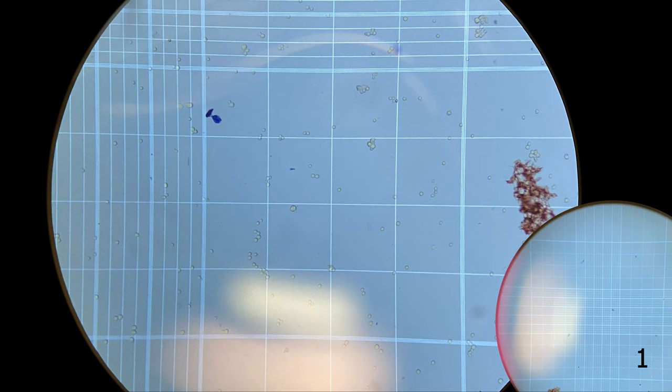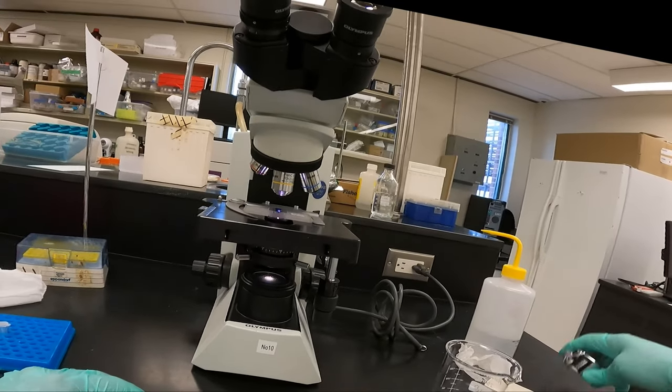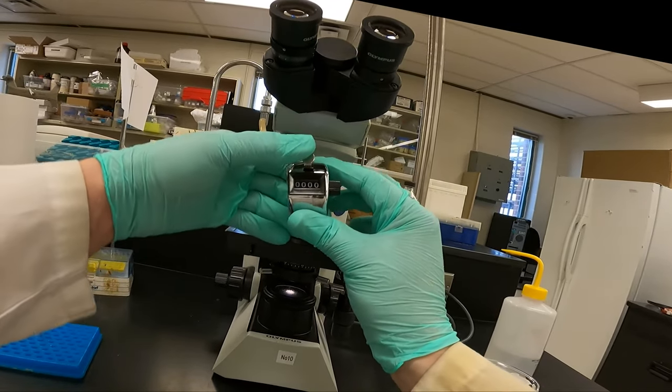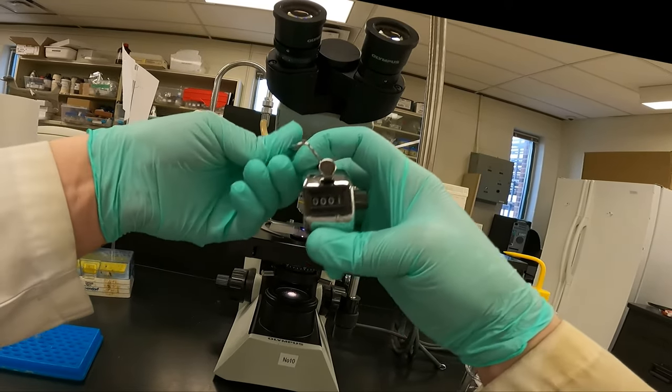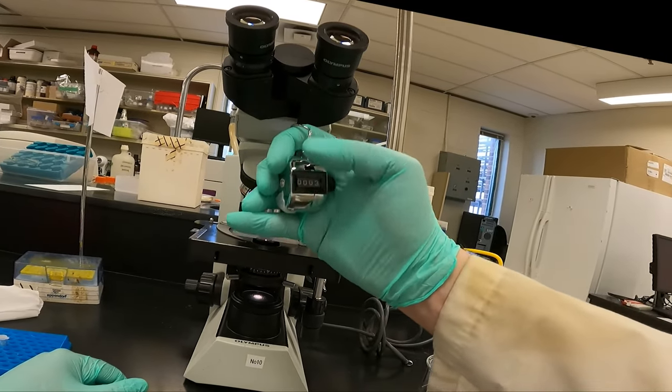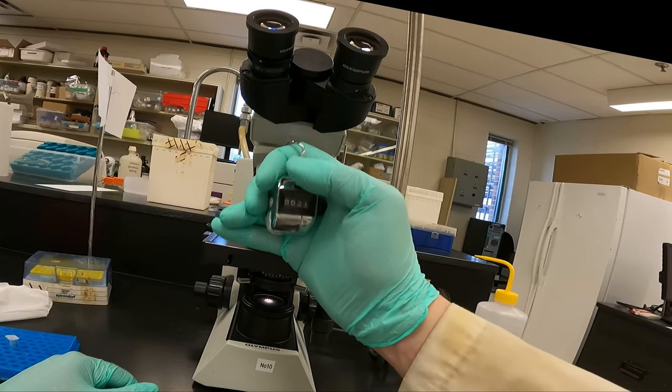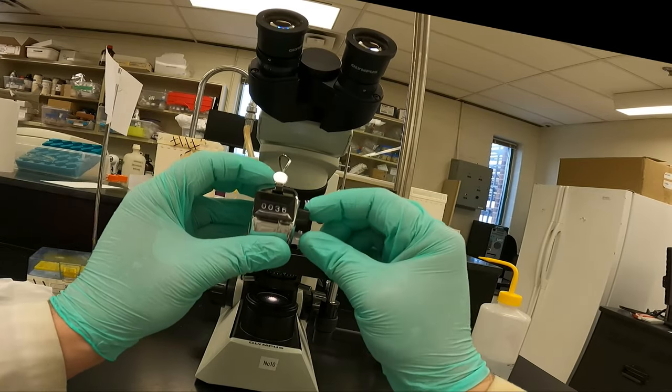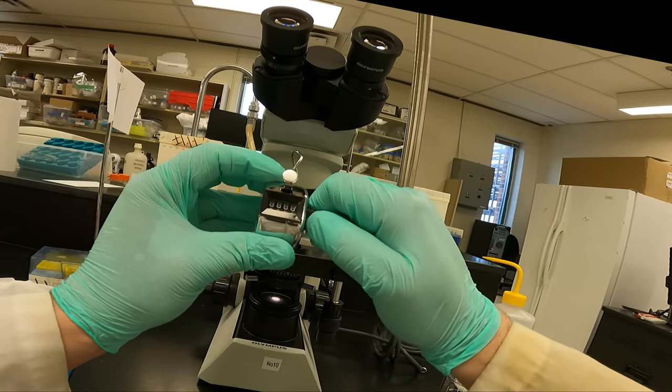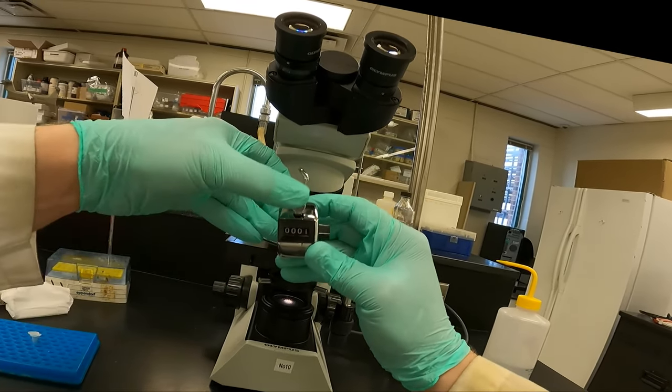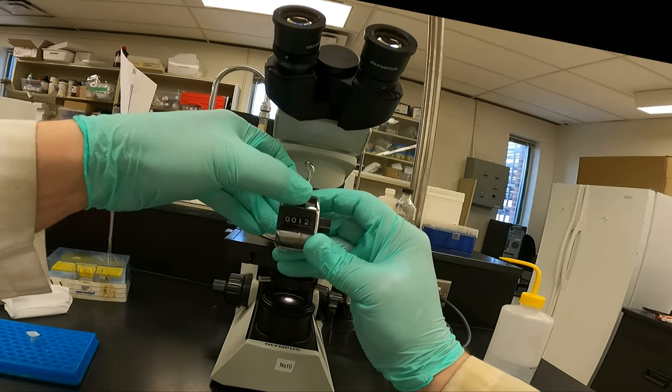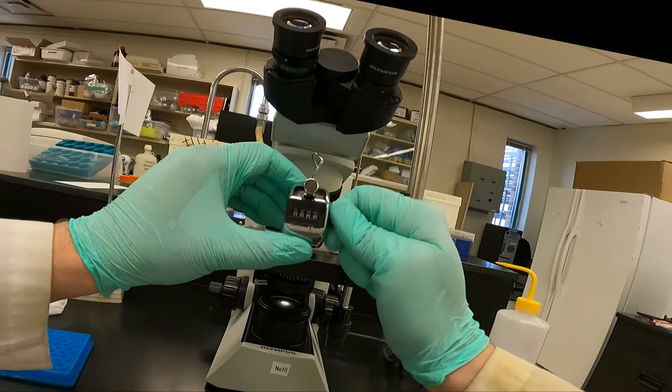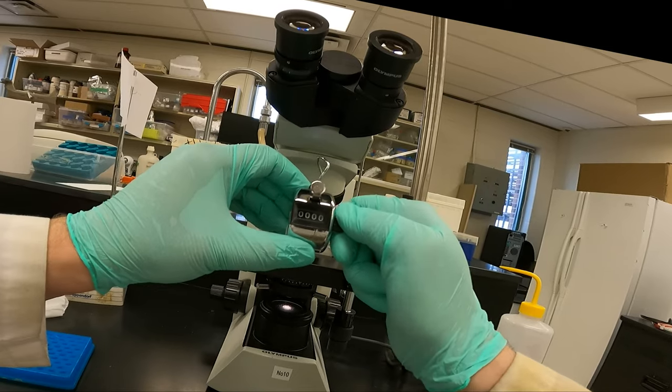This is what the tally counter looks like and how it works. You can see, we press this button, and every time we press it, it goes up by one. So we can quickly count our cells, read off, record our data, and then reset it by turning this knob on the side. Again, press the button every time you see a cell, and then at the end, reset it. Like so.